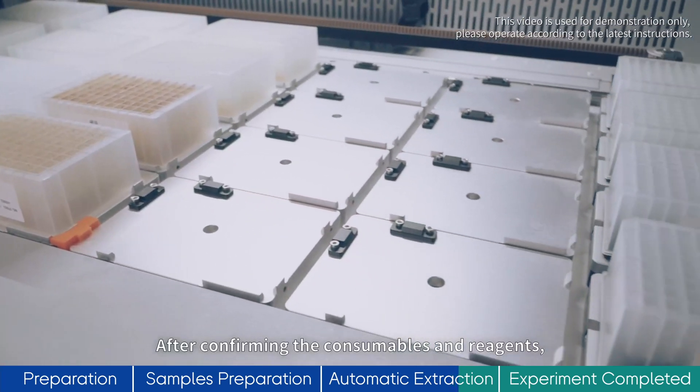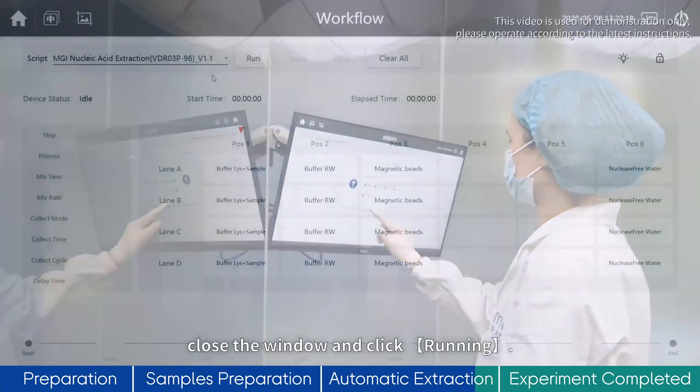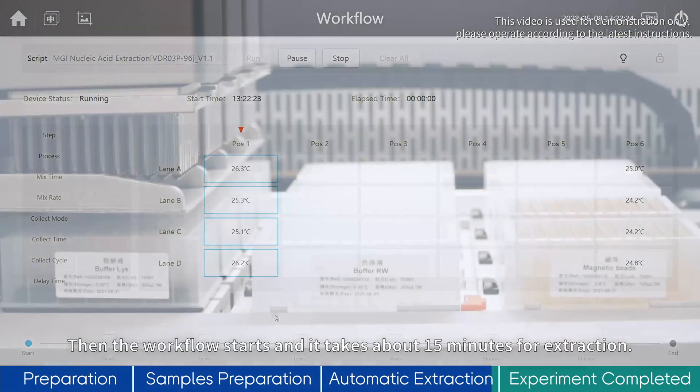After confirming the consumables and reagents, close the window and click Running. The workflow starts and it takes about 15 minutes for extraction.